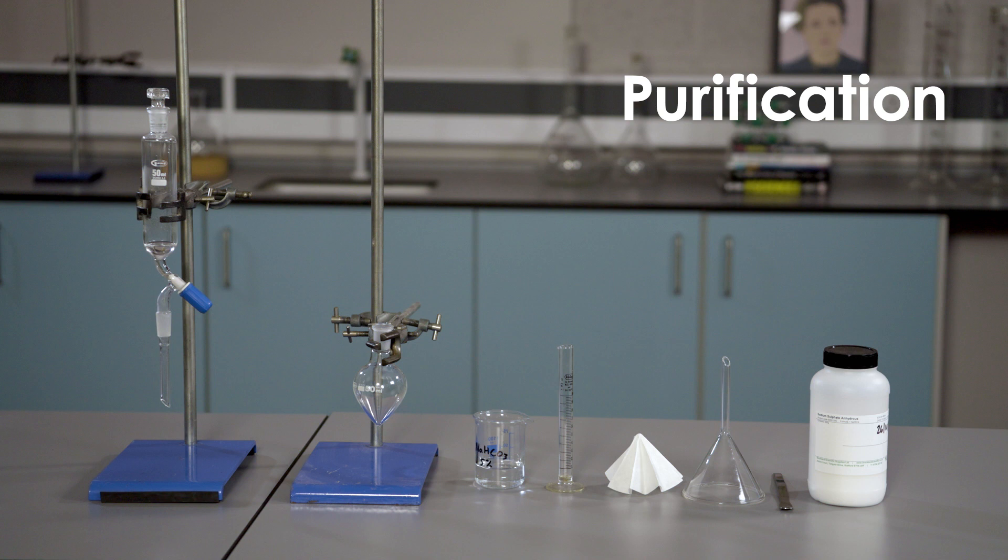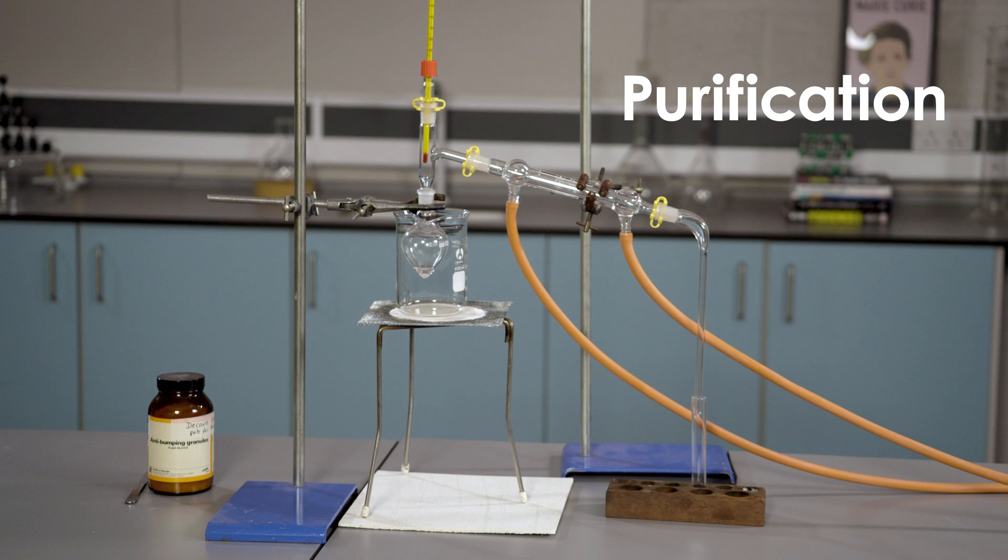You can think of this as a next level separation, where we remove any traces of water, unreacted starting reactants, and byproducts that still remain to get our products pure.